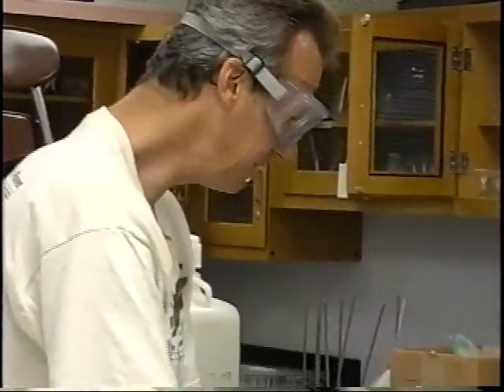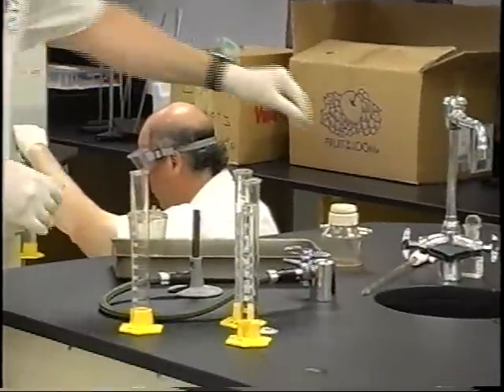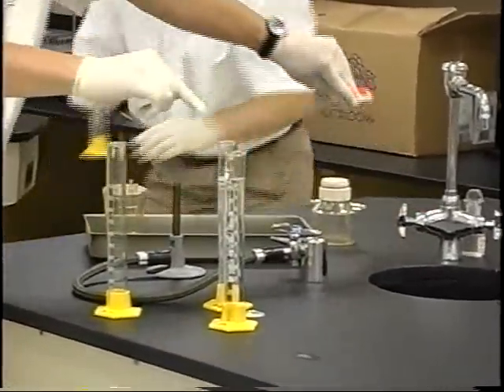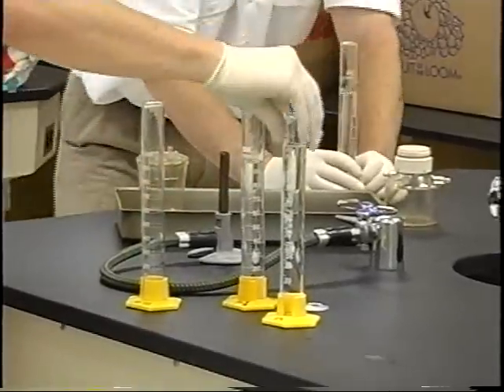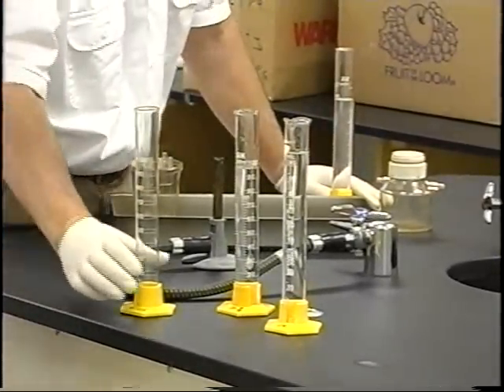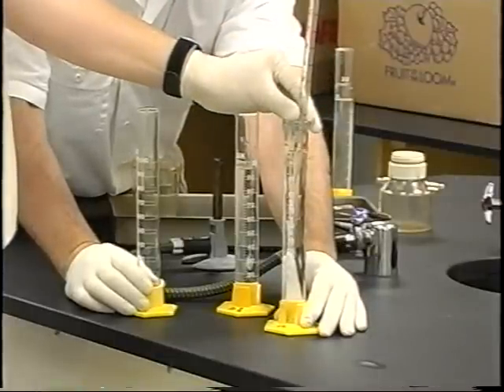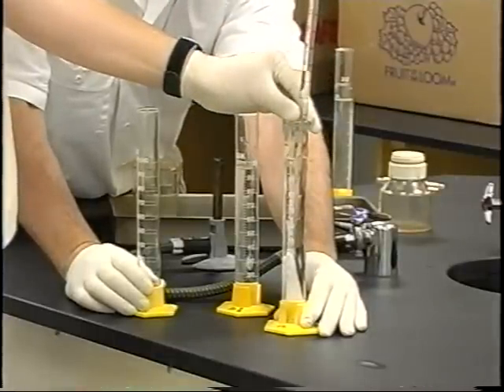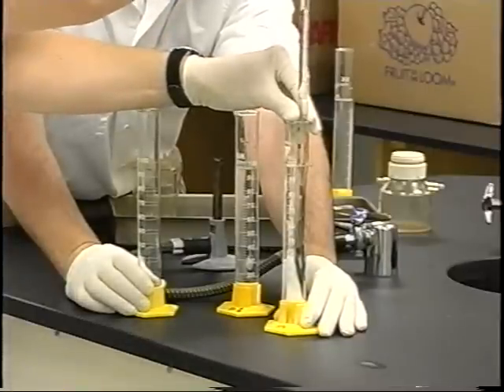I don't need to make a further one, so I'm just going to have 90 mLs of deionized water and 10 mLs from this sample. So here's my 10.